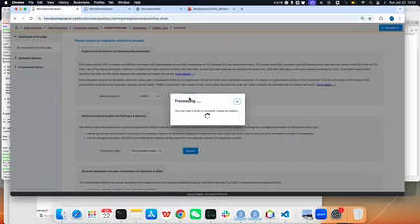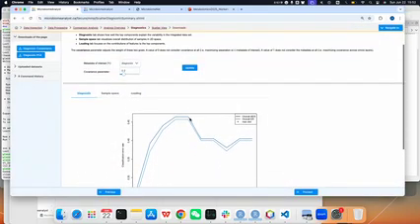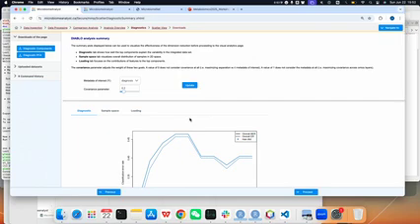Diablo, because the modeling may take slightly longer than the Procrustes. Okay, it works. So here we can see, as we mentioned, Diablo is a supervised method, so we can control how many covariance we want to include in our model. If the value is 0, it means it doesn't consider the covariance at all.